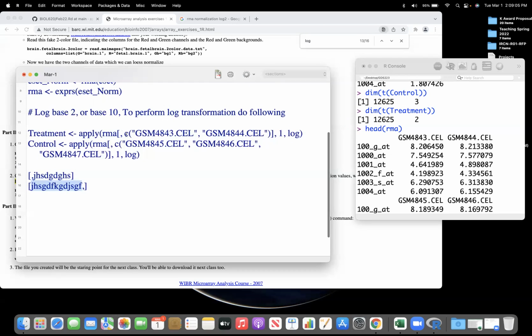So in this case, I have a comma before something, right? So I'm pointing to the columns. And which columns? The first two entries. Exactly. So why the C? That's a very good question. Why is the C here?